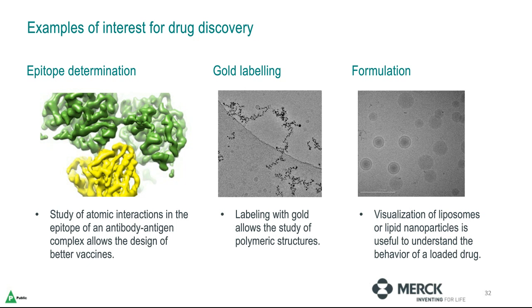And by pure visualization also, we are able to study what is the effect of different formulations of drugs in liposomes or lipid nanoparticles. That's the image at the right. And adjust them properly based on the size, shape, or features, contrast, or diffraction if there is a crystalline state inside a liposome. And with this, I leave the rest of the talk about the coming advances in throughput of this technique to Ali.